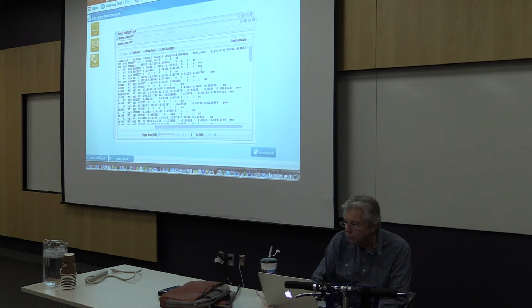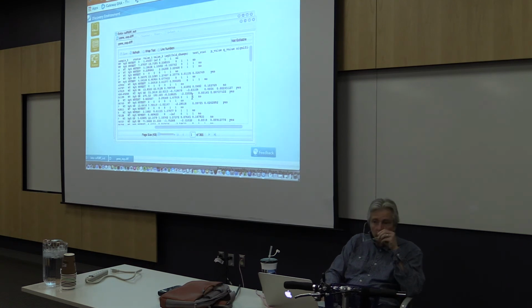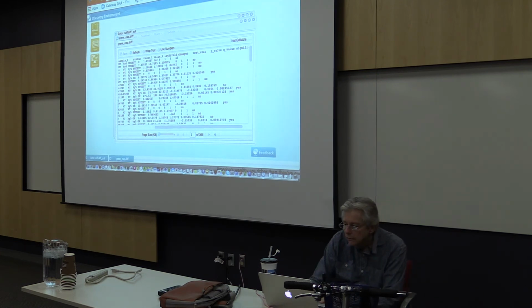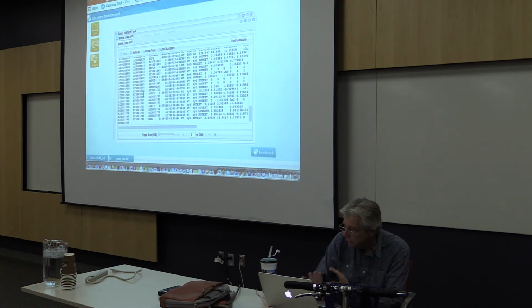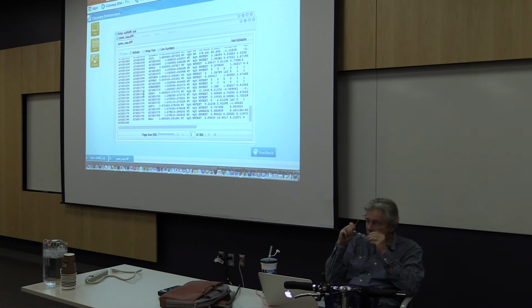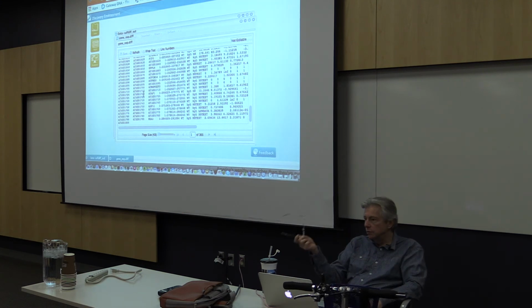Yes, no, no meaning it's not significant. Yes, it is statistically significant, depending on how you define statistically significant. So these are the results that you'd be looking at. And these are all gene names in this case, names that you should recognize if you work with Arabidopsis, pulled right out of the annotation information.